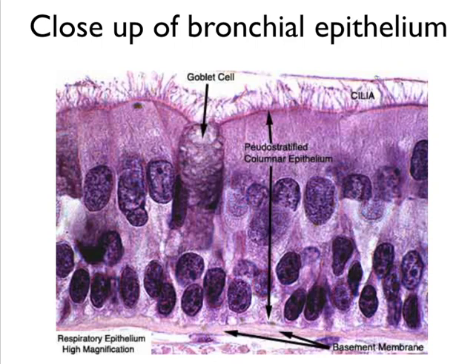So what does it actually look like under a microscope? Well, it looks like this. Here we have the basement membrane, the thin pink layer, and on top of that you have the basal epithelial cells. So this is a nucleus, this is another nucleus, and then here we have a goblet cell, which looks like a cell that's filled with stuff. And on top of the basal epithelial cells you have the ciliated epithelial cells. The cilia are clearly visible here as little hairs, and you can actually see some mucus on top of that as well.